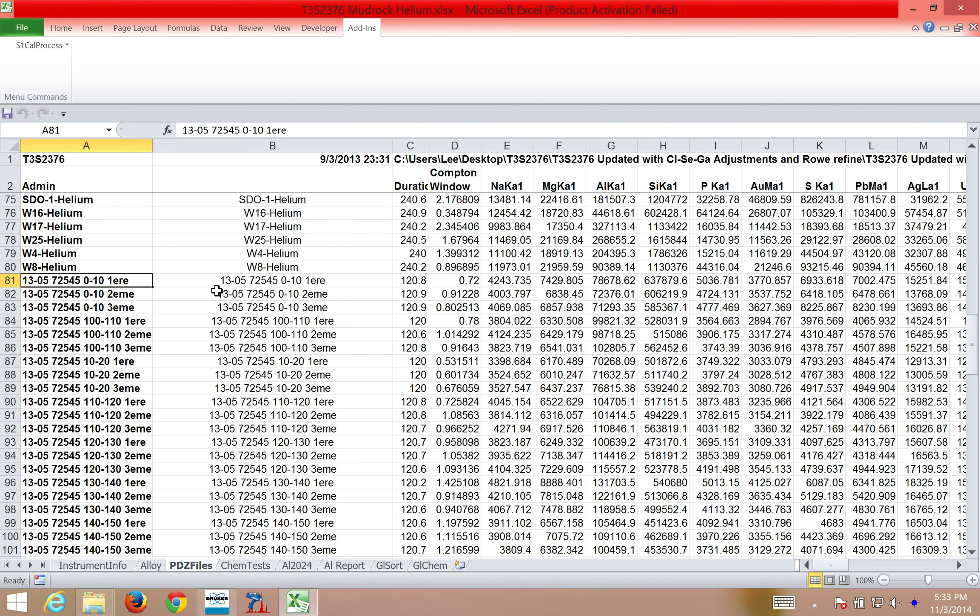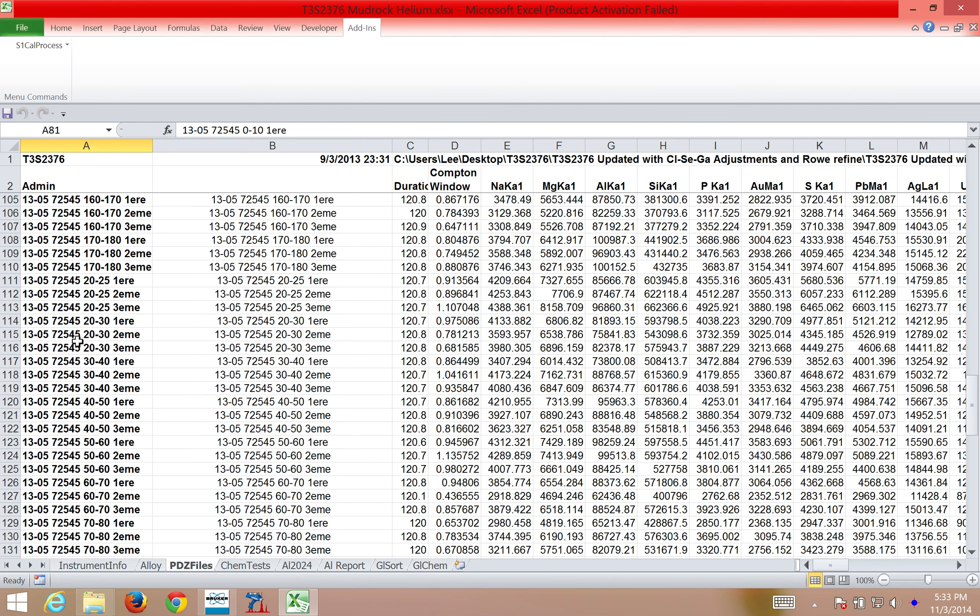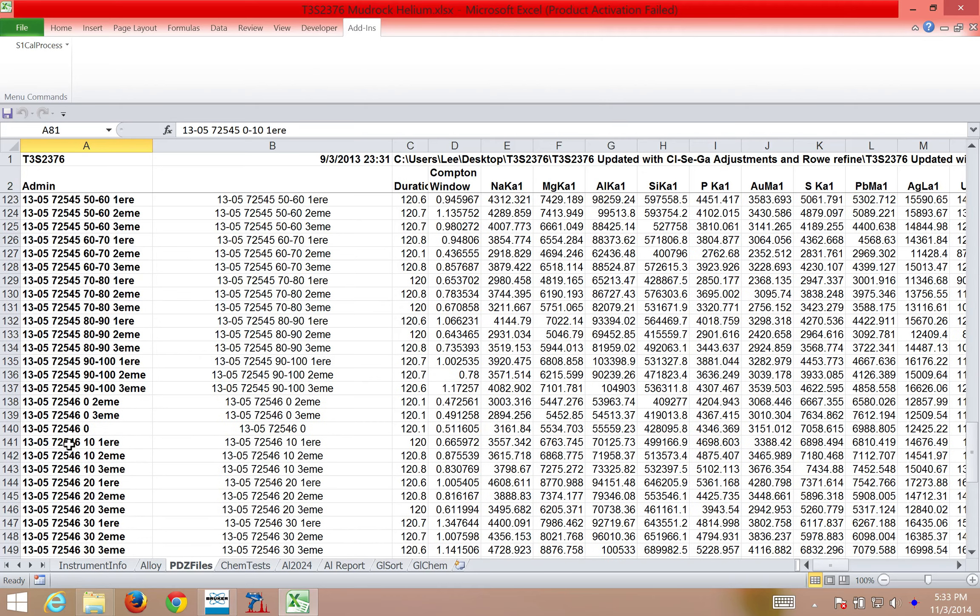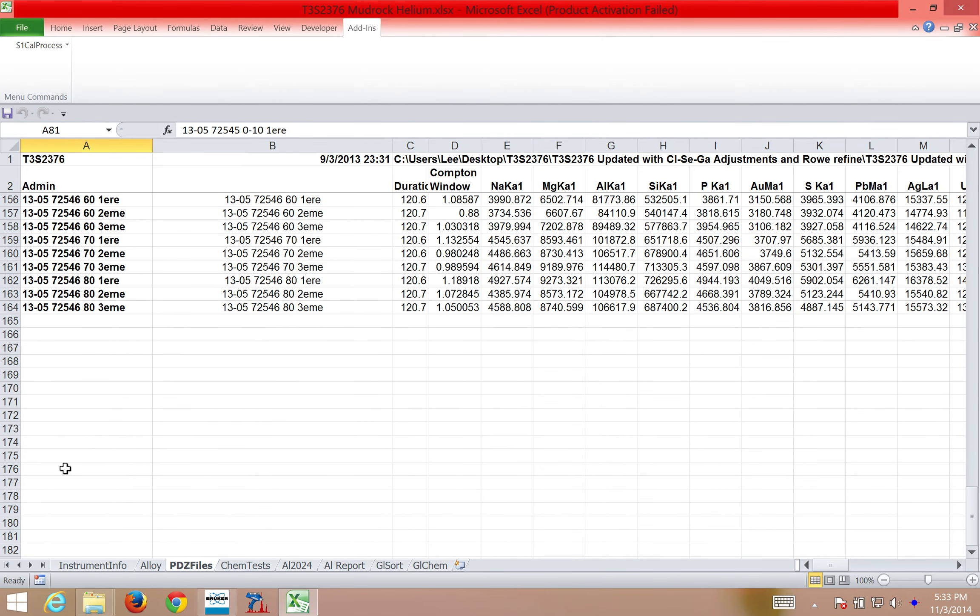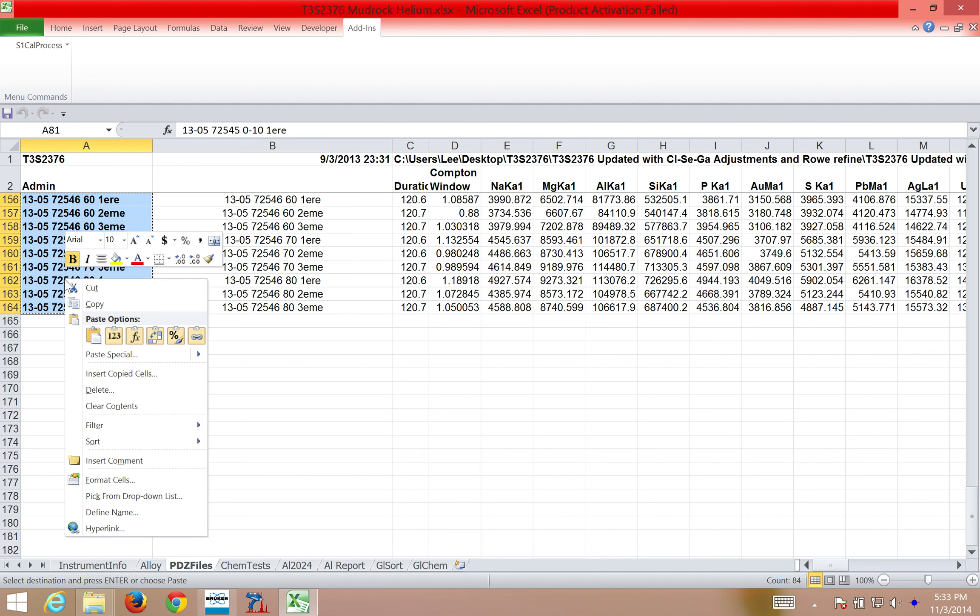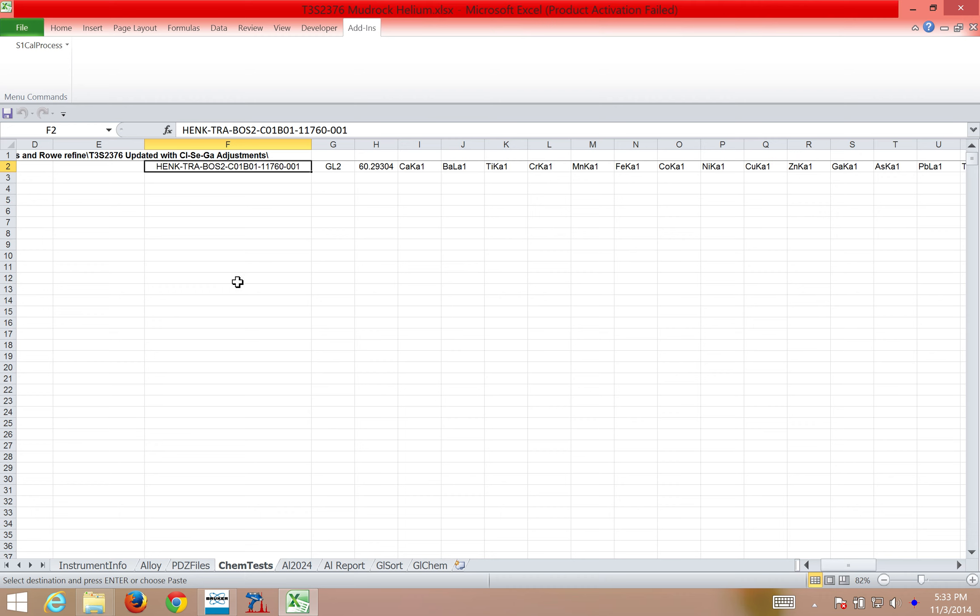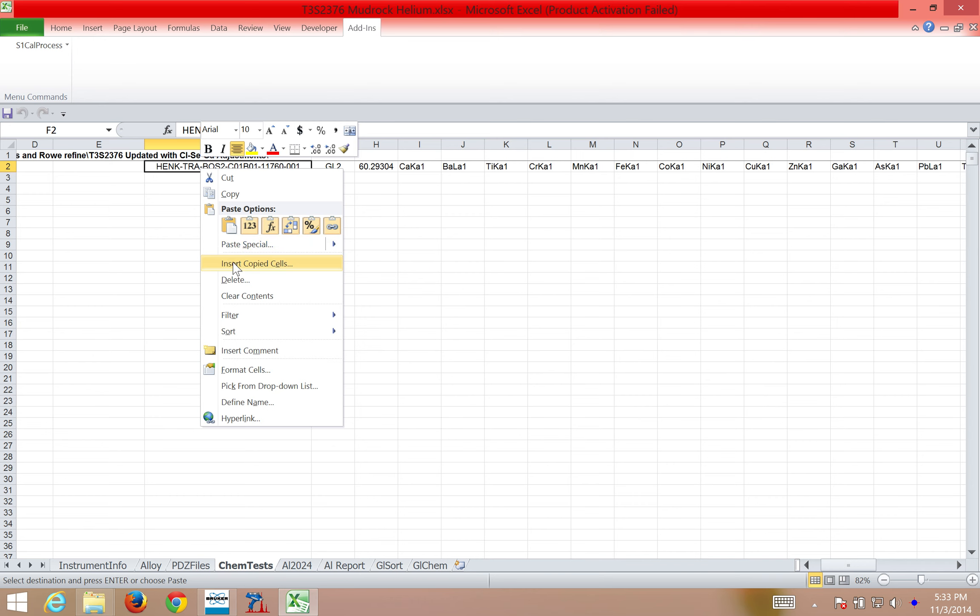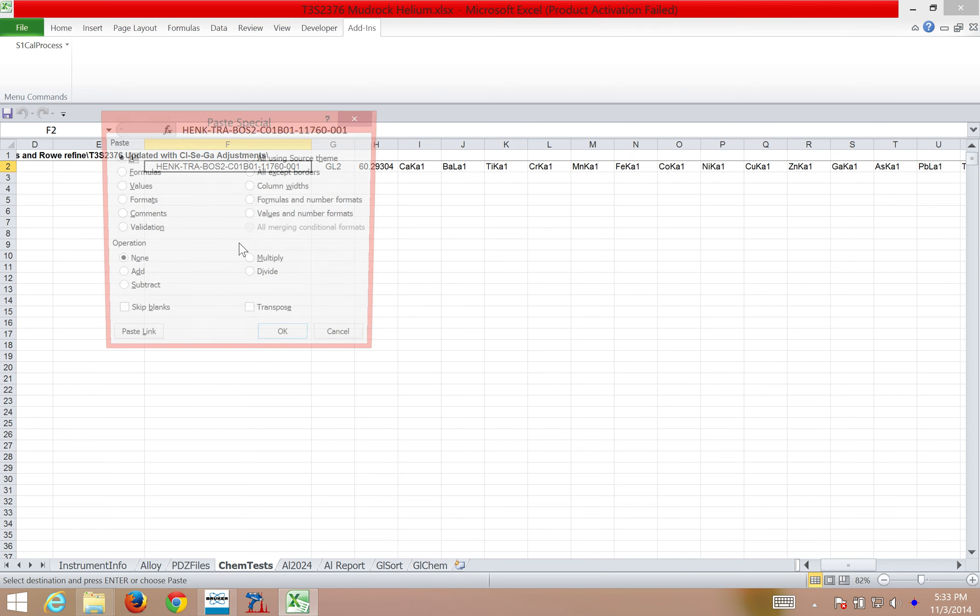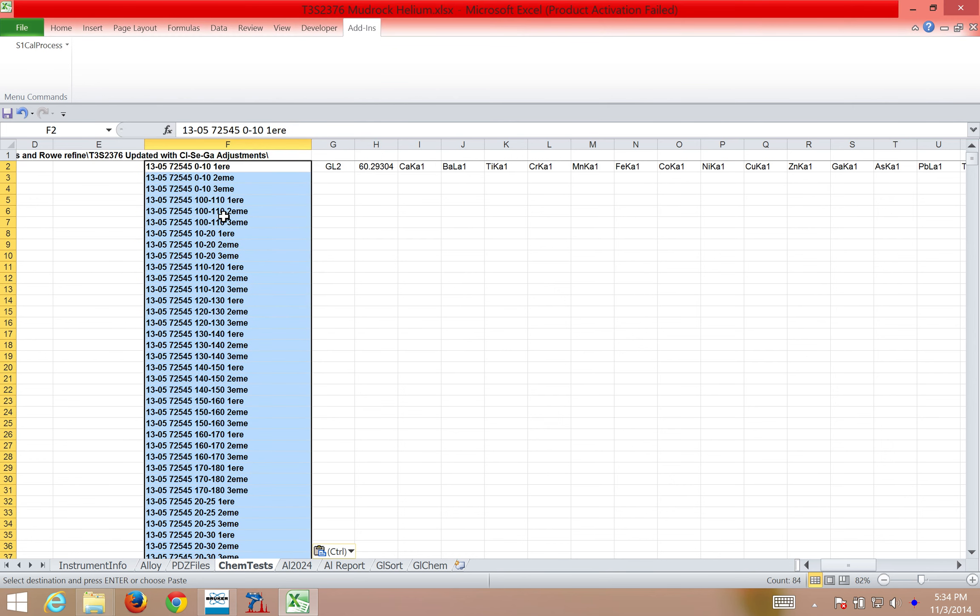The next step is I'm going to copy the names of these spectra that I've just added to the spreadsheet, and Ctrl-C to copy. I can also right-click and select Copy. Now I'm going to come over to the ChemTest file. In the ChemTest file, I add those spectra here by right-clicking and selecting Paste. So here the names are pasted for those spectrum.